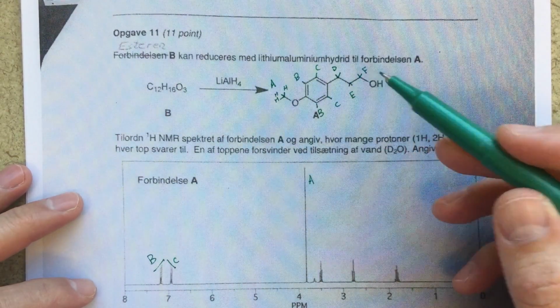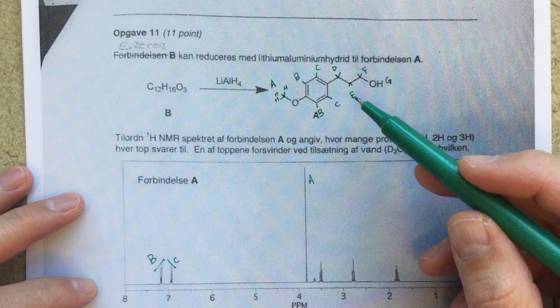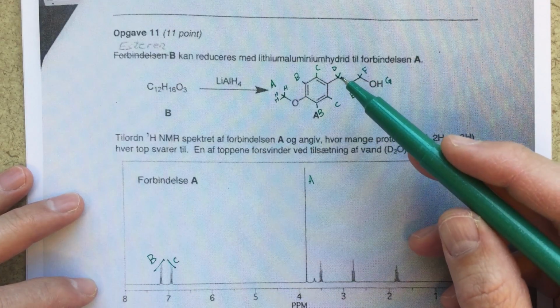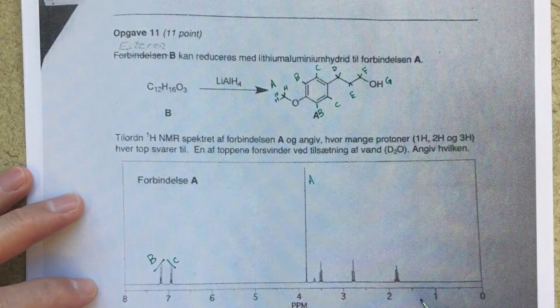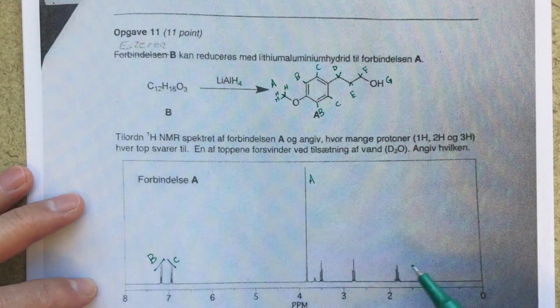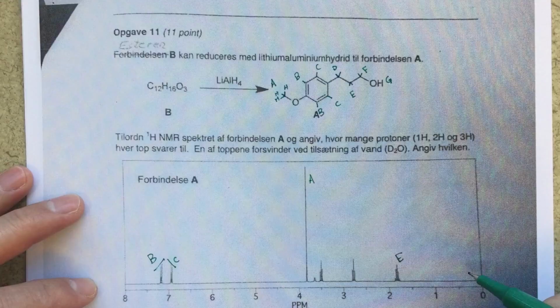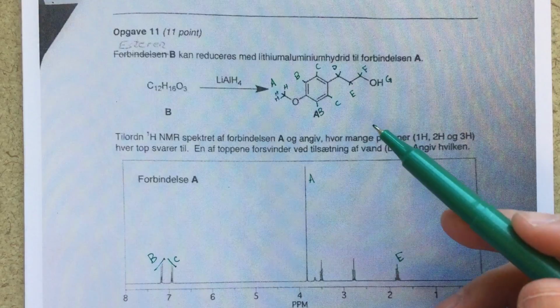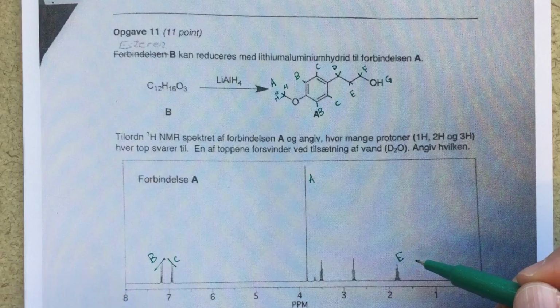All right, next, D, E, and F. So now for D, E, and F, I think the easiest one is going to be E. E should be a multiplet, so I've got splitting from both F and D. So really we could call it a triplet of triplets. But it's going to be pretty complicated, and it should integrate to 2. So I see 1, 2, 3 more peaks. These should all integrate to 2. They seem about the same height as B and C. So this one's the most complicated splitting. We're going to call that one E. It's also the furthest upfield, and I would say that this E proton is being sort of shielded by D and F, so I would also expect that to be the most upfield. So pretty clearly I think that that's E.